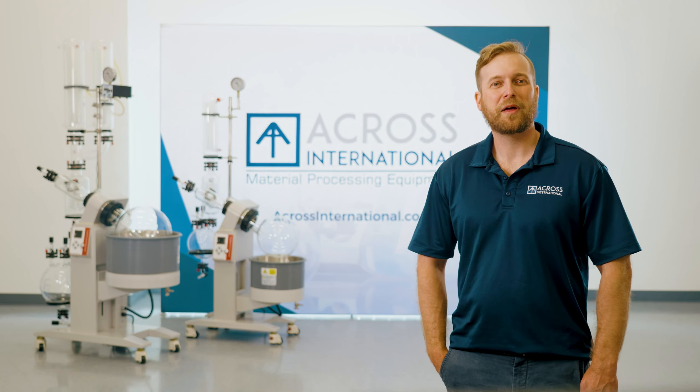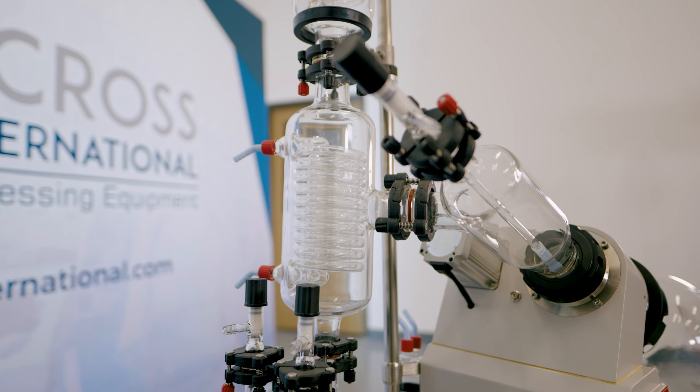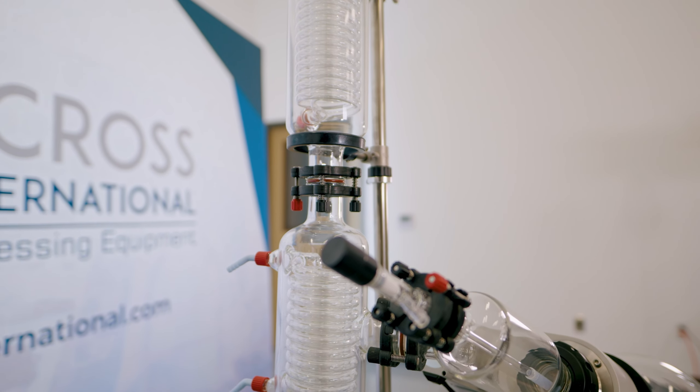In addition to our quality construction and glassware, we also feature top-tier auxiliaries. The Contrerto controller, for example, can allow for four vacuum channels to be run independently of each other, yet off the same pump. This is ideal when utilizing a centralized vacuum pump for several rotary evaporators.